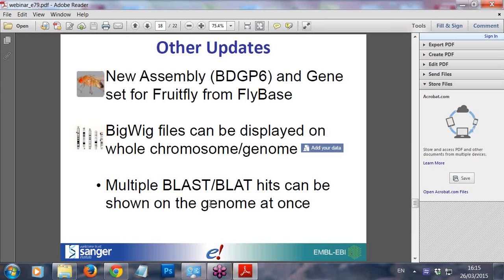Some other updates: we have a new assembly and gene set for fruit fly coming from FlyBase. There's now the ability to upload your own data in BigWig format and display it on the whole chromosome or genome — use the Add Your Data button. You can show your data as arrows along the karyotype. Finally, if you run multiple BLAST or BLAT jobs using the same input form with two or three sequences, those hits can be shown on the genome all at once so you can compare hits from different queries.